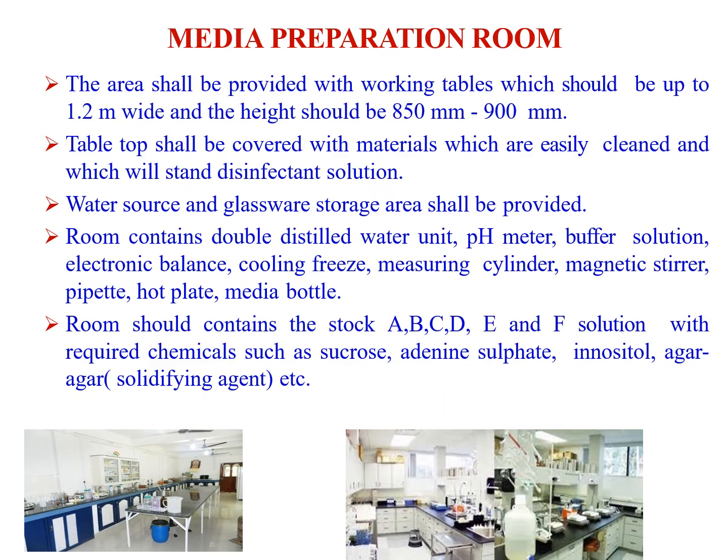The media preparation, we have a very big lecture on media preparation separately, but there should be a separate room. We should have some space and we should have some racks, shelves for maintaining chemicals which are required for the preparation of the medium, and there should be provision of a fridge for maintaining vitamins, hormones, and stocks.